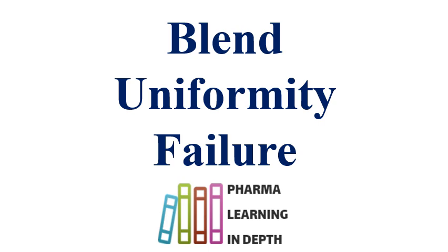This blend is then used for capsule filling, sachet filling, or tablet compression. Blend uniformity testing is an in-process test before the tablet compression, capsule filling, or sachet filling. It is also done for some products like dry syrups, powder for oral suspension, and powder for oral administration.